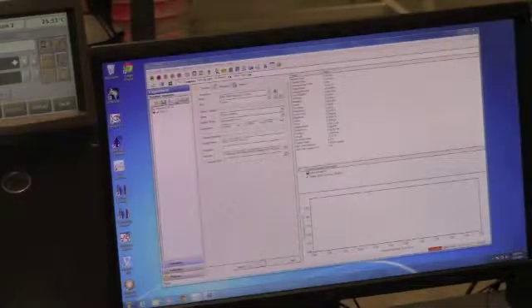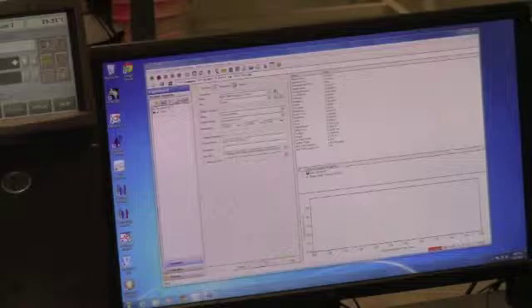This tab has two sections: a Method tab, where you can enter things such as force, stress, and amplitude of the tests, and a Frequency tab, where you can enter what frequencies you wish to run this test at.